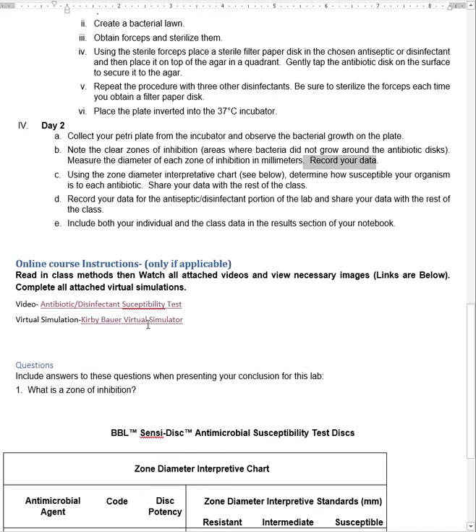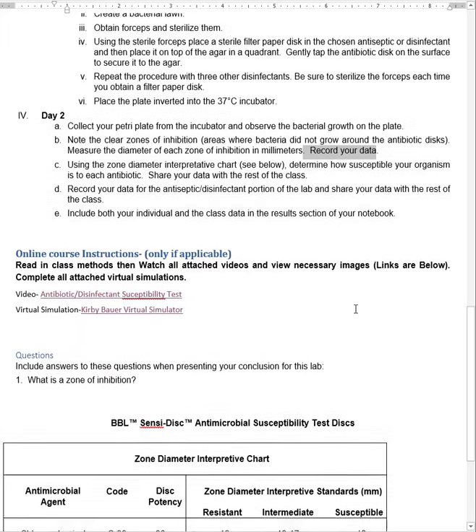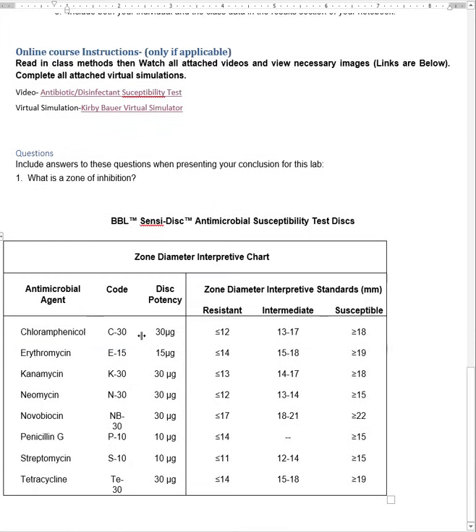Here are the two videos. This one's really good. I'm sorry, this is not a video. This is our simulation. I would do it. So there is some of the antibiotics: chloramphenicol, erythromycin, kanamycin, neomycin, novobiocin, penicillin, streptomycin, and tetracycline. And here is our zone standards in millimeters.